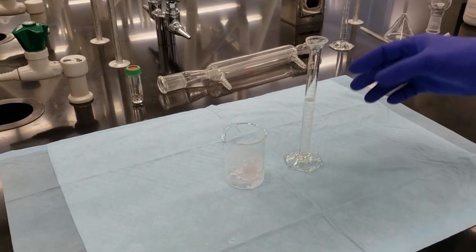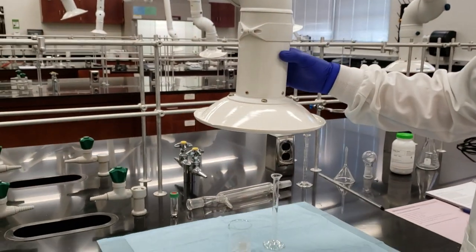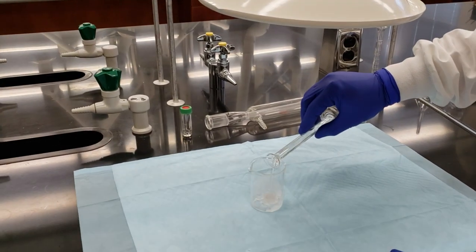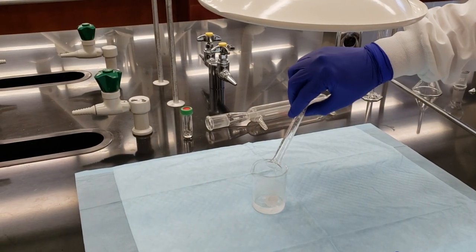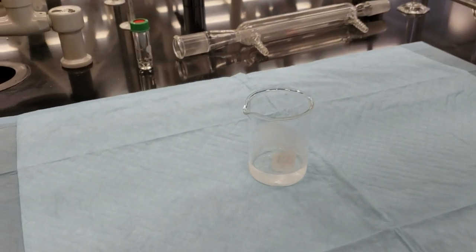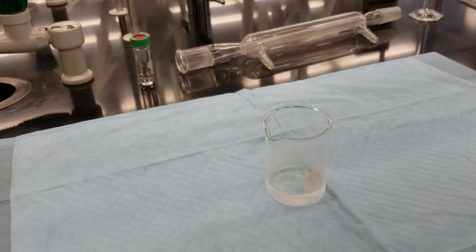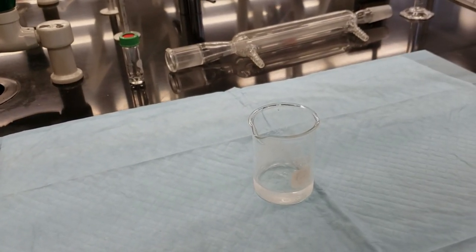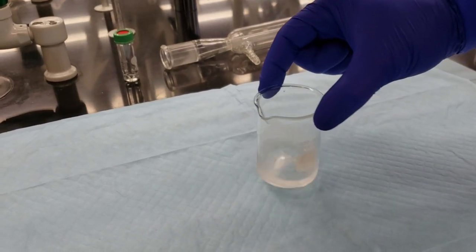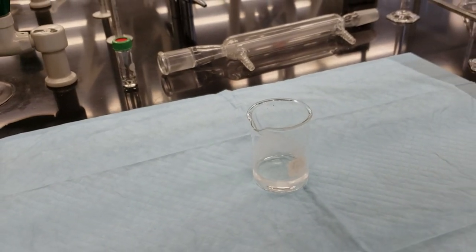This is an exothermic reaction. Of course, our sulfuric acid is going to be fuming. That's why we're underneath our snorkel here. So we'll go ahead and mix these two together very carefully. And you can see how quickly the ice melts in the presence of the acid. We'll let that mix and we'll go ahead and weigh out the other components.